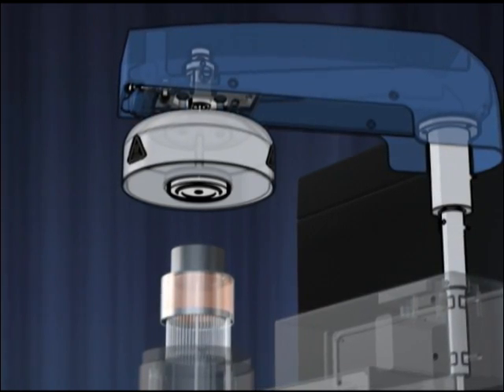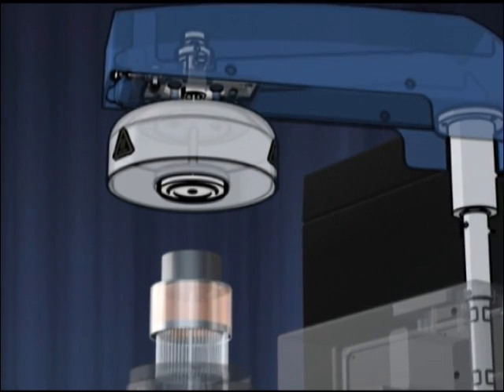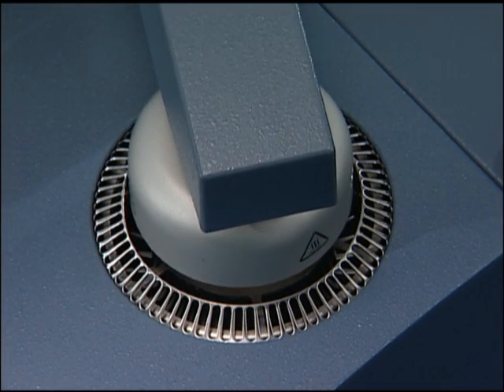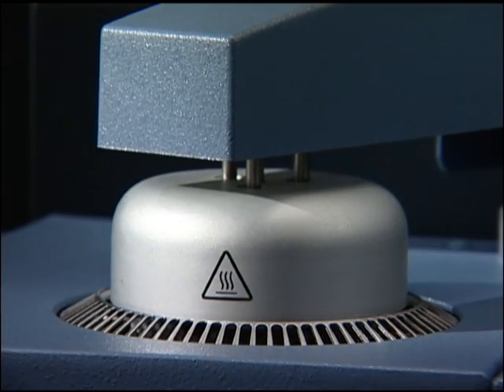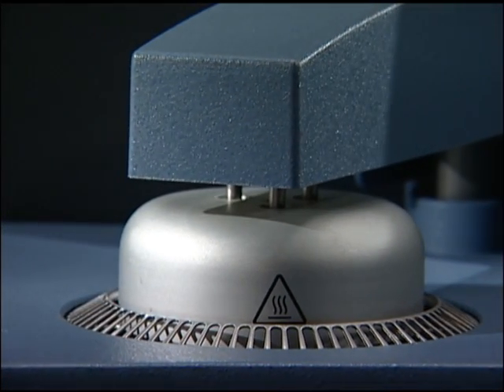The improved Q-Series Auto Lid design assures reproducible placement of the silver lids as well as efficient exhaust of the purge gas. The redesigned Auto Lid also effectively isolates the DSC cell from environmental effects, thereby improving measurement accuracy.